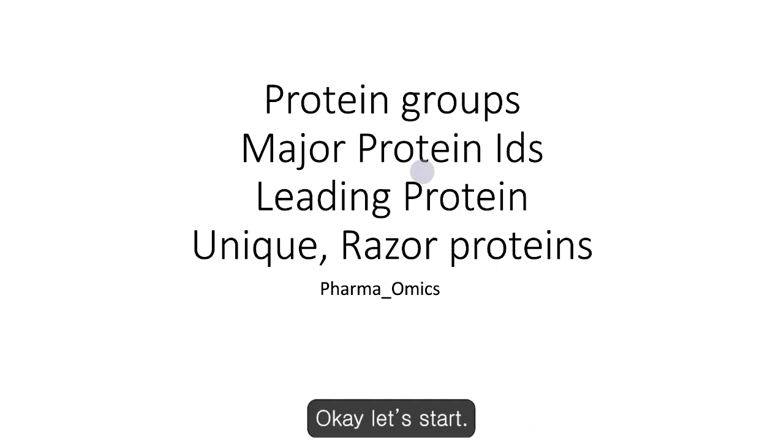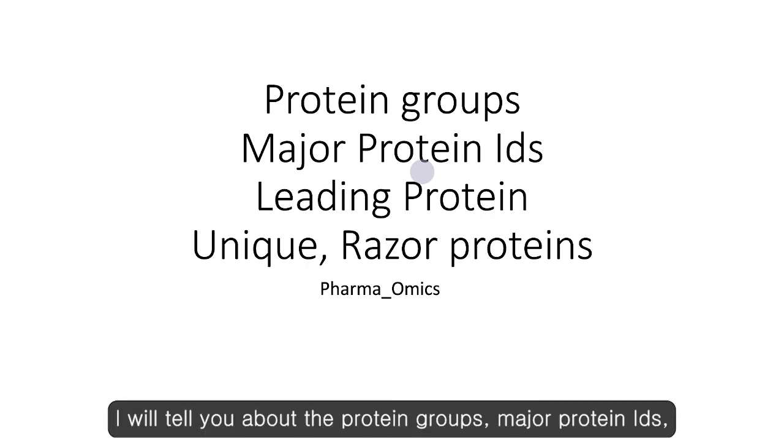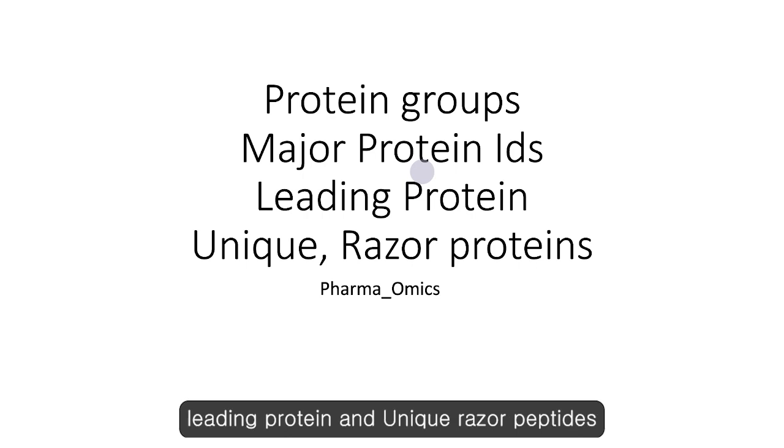Okay, let's start. I am Pharmaomics. In today's lecture, I will tell you about the protein groups, major protein IDs, leading protein, and unique and razor peptide.